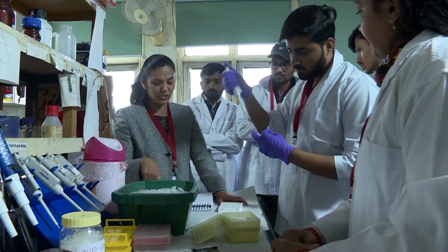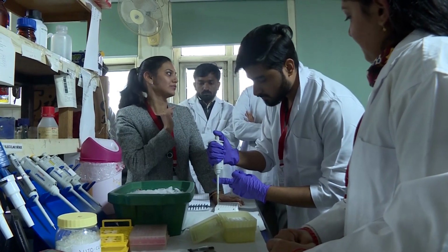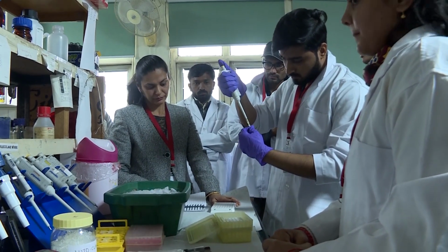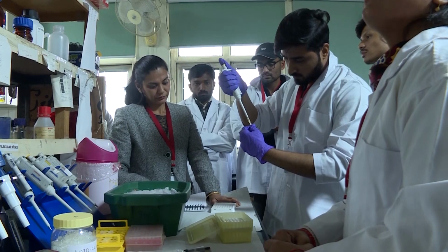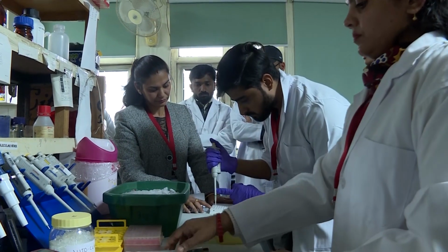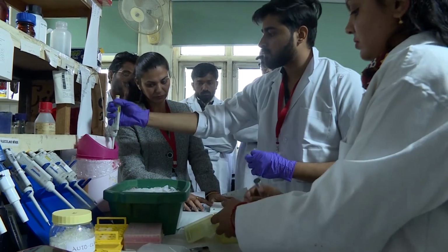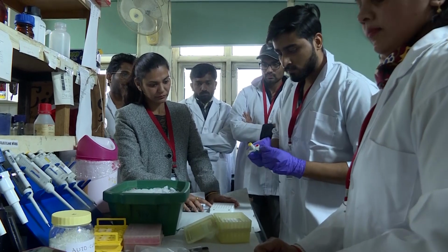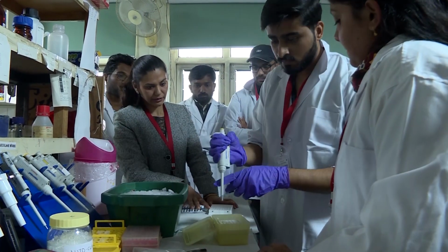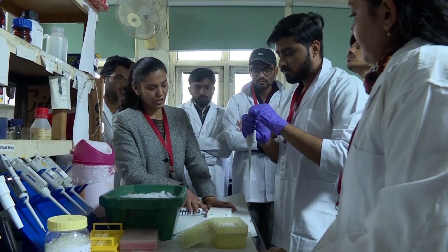The real-time machine also needs the same information, in which well what we are going to feed. Heat stress actin, endogenous gene. A4, B4.